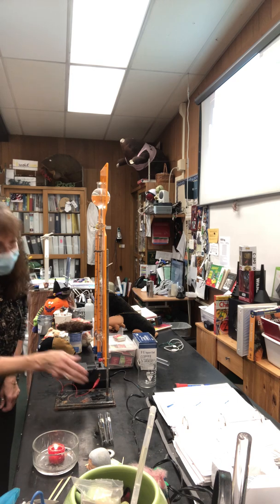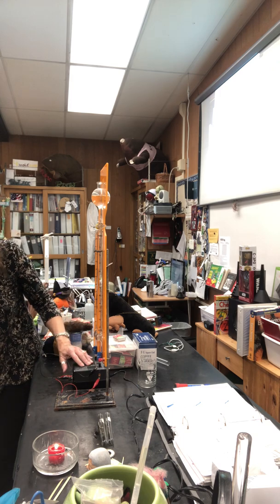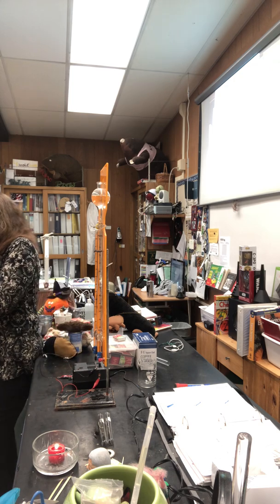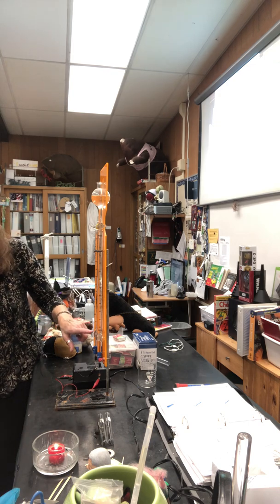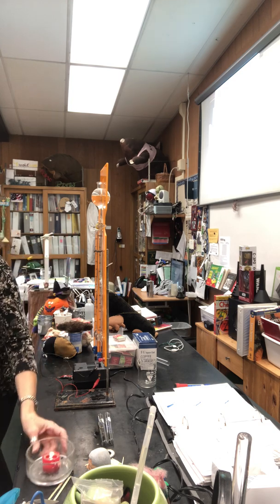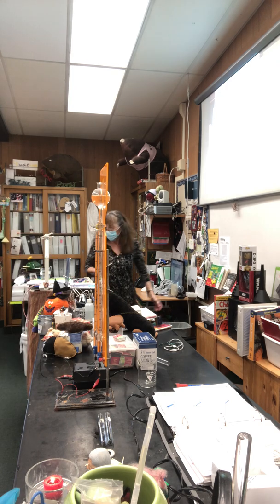Hook up the alligator clips. You're going to do something like this, but with a 9-volt battery, not a converter. I don't have the money to buy converters for everybody. Okay, and it's going to start running, and on the surface of the platinum, well, maybe just the people in the front, you'll be able to see bubbles forming and rising up, okay? And so we're going to let this run for a bit. I've got a candle for later, not just for ambiance.